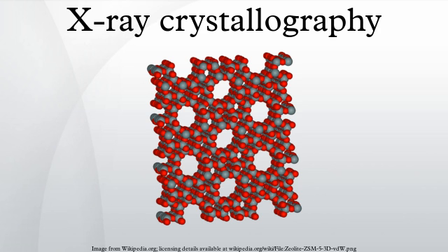One image of spots is insufficient to reconstruct the whole crystal. It represents only a small slice of the full Fourier transform. To collect all the necessary information, the crystal must be rotated step by step through 180 degrees, with an image recorded at every step. Actually, slightly more than 180 degrees is required to cover reciprocal space, due to the curvature of the Ewald sphere. However, if the crystal has a higher symmetry, a smaller angular range such as 90 degrees or 45 degrees may be recorded.